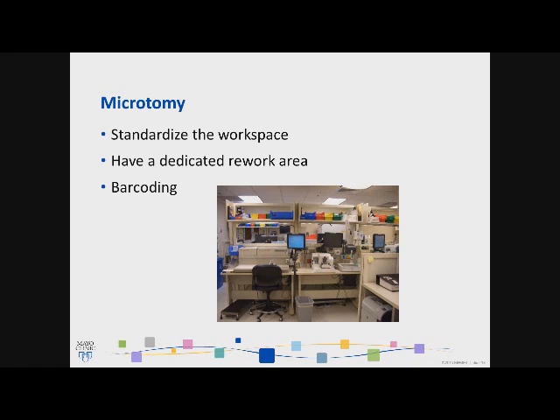The other thing we try to do with our current barcoding system is to not leave any labeled slides out to be grabbed and then have tissue placed on that slide, so that slide is then thrown away and we just have to reprint the label. Previously, when all of our slides were pre-printed, this was much more of an issue until we went into this barcoding system.